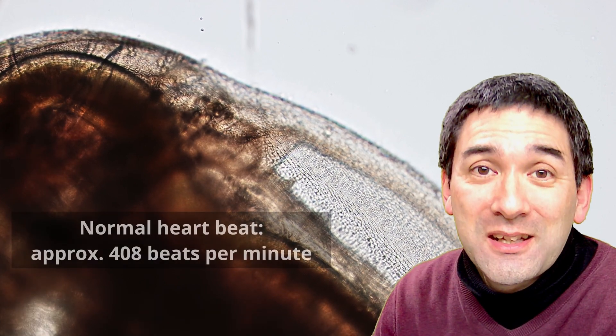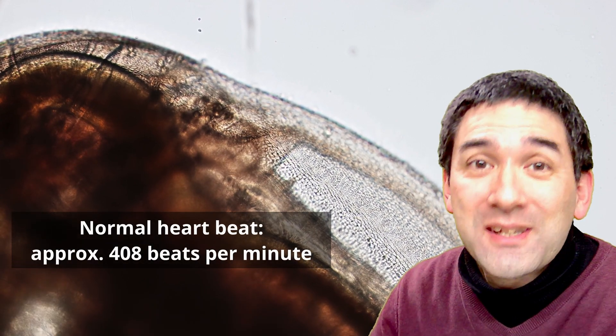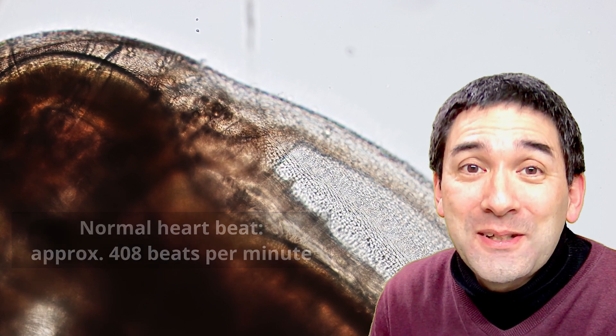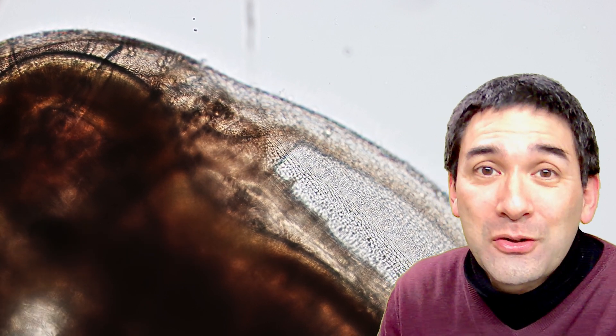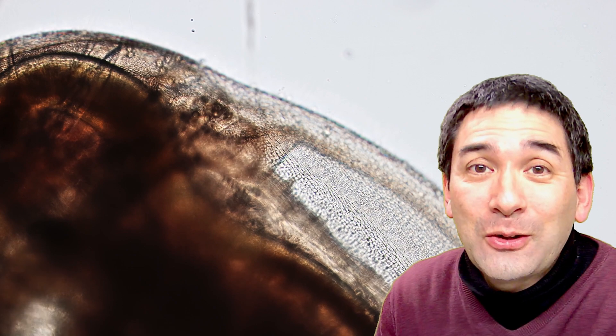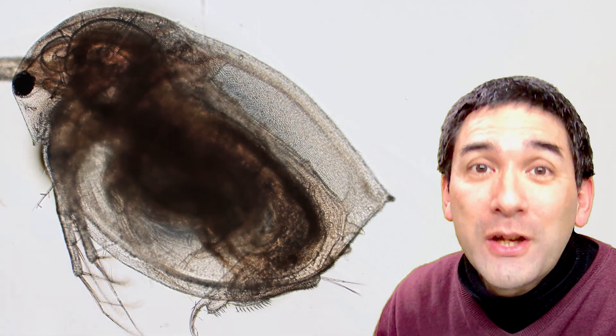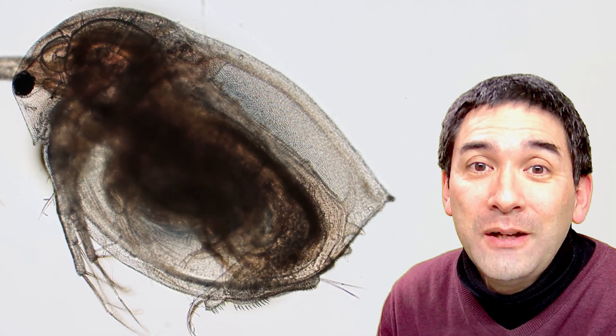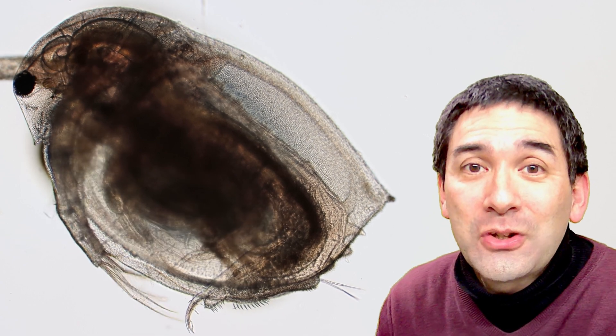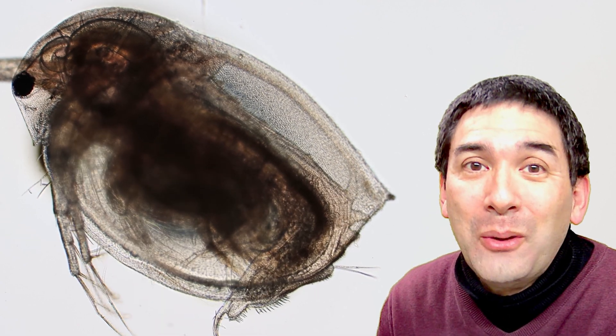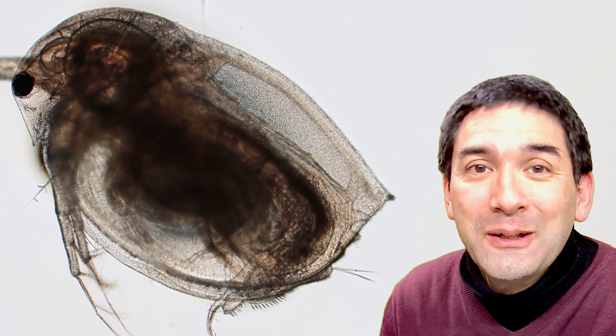Yeah, so this actually shows that this effect is also reversible, but there's a second thing that happened. Notice that the whole Daphnia also started to move again, because the alcohol not only slowed down the heartbeat but generally the movement of the Daphnia itself. And now as the heart starts beating faster, the whole water flea also starts to move a little bit more.